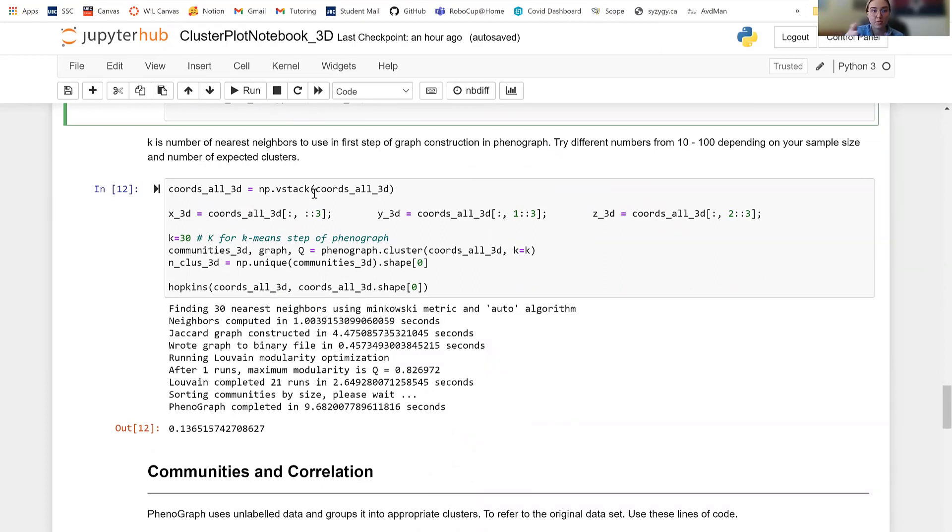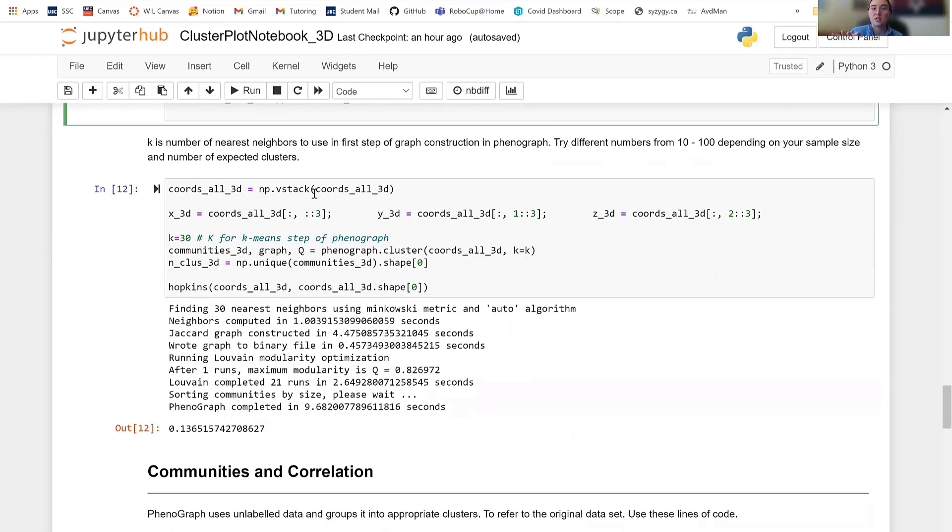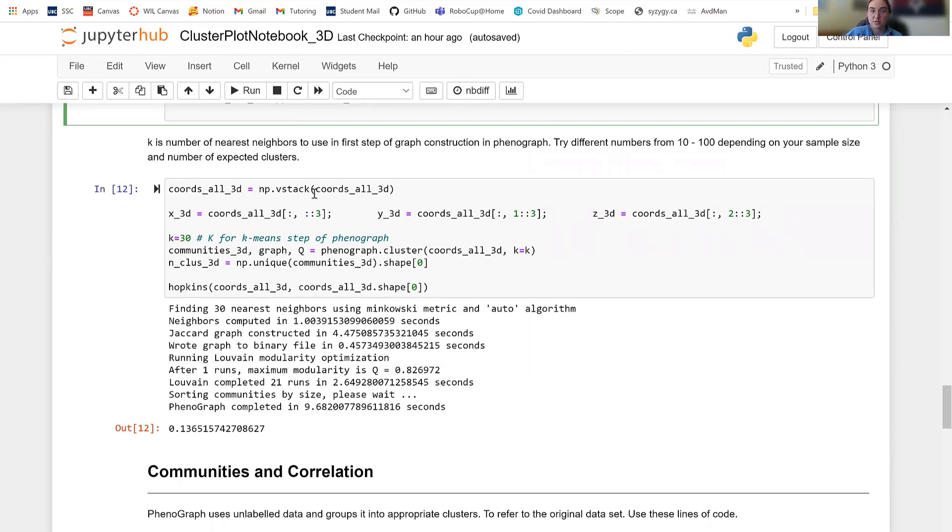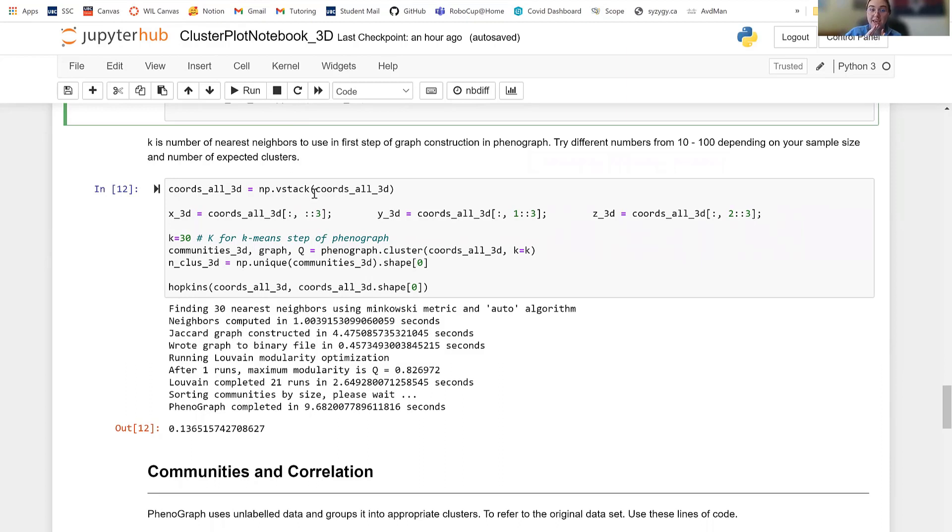I've already ran it. And then you're going to come down here which is, this is the part where it actually clusters things. So clustering here works that you're going to cluster the x, y, and z coordinates. If you're doing 2D, you're only clustering the x and y coordinates. Next, you're going to set the K value. I've used K equals 30. From my understanding, that's a pretty standard K value. But K is the number of nearest neighbors to use in the first step of graph construction in phenograph.